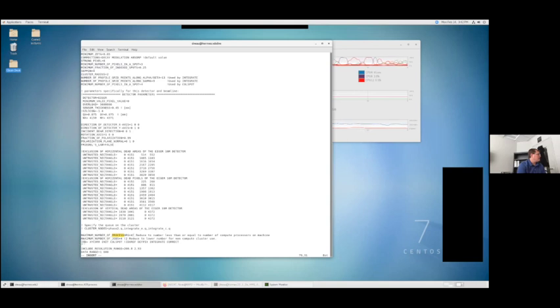The next thing you want to look at is job equals. Okay, this is where it actually tells XDS which steps I'm trying to do. And in general, what you want to do is start with all of these uncommented, and that would run through the entire process of XDS.